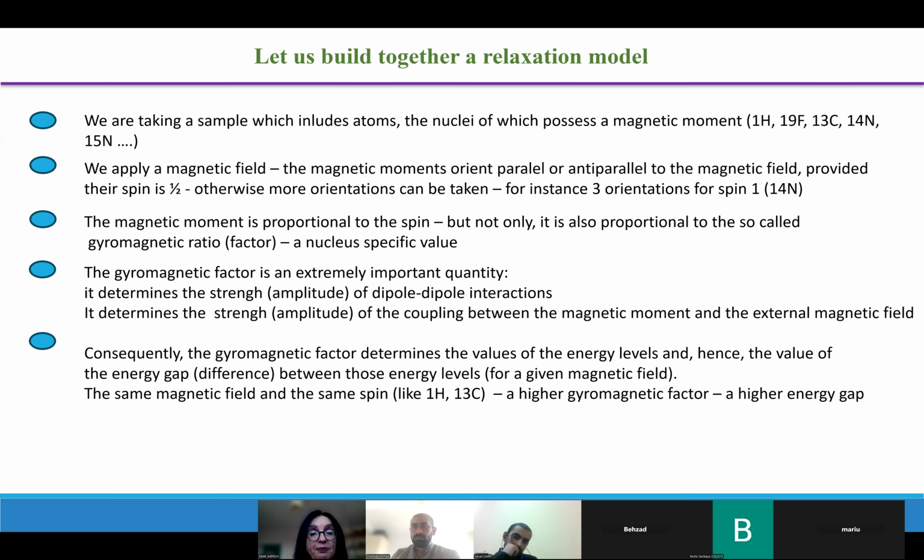However, in principle, one could also plot the relaxation rate, reciprocal relaxation times, versus magnetic field. The ratio is 1 Tesla equal to 42 megahertz. However, this is where the resonance frequency comes from.